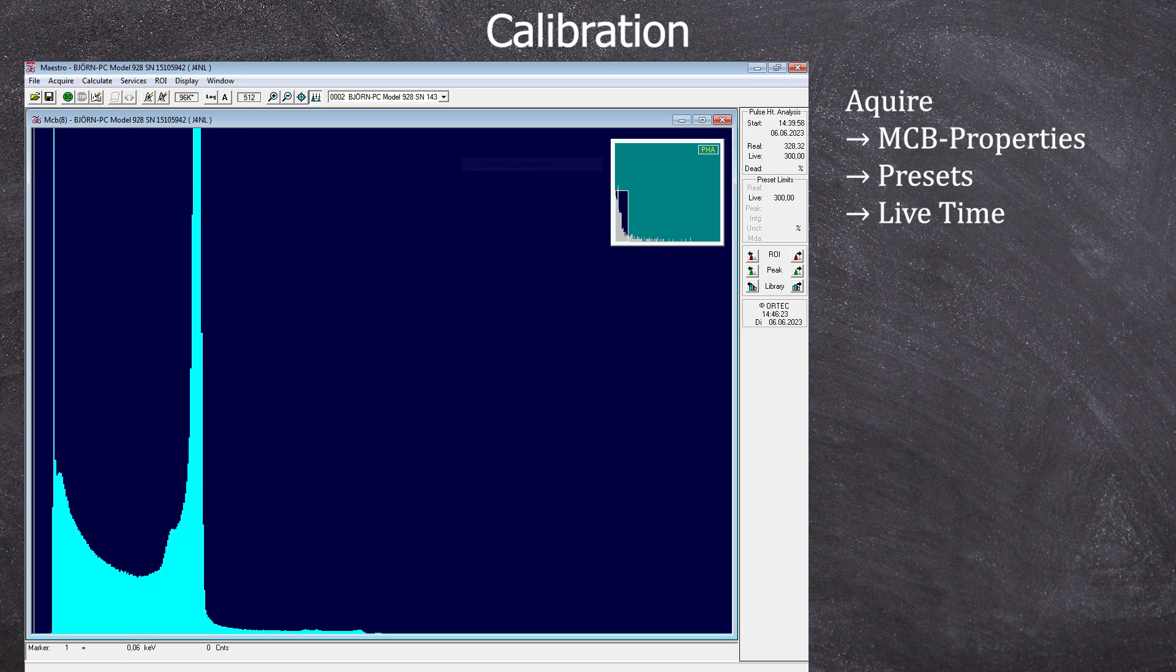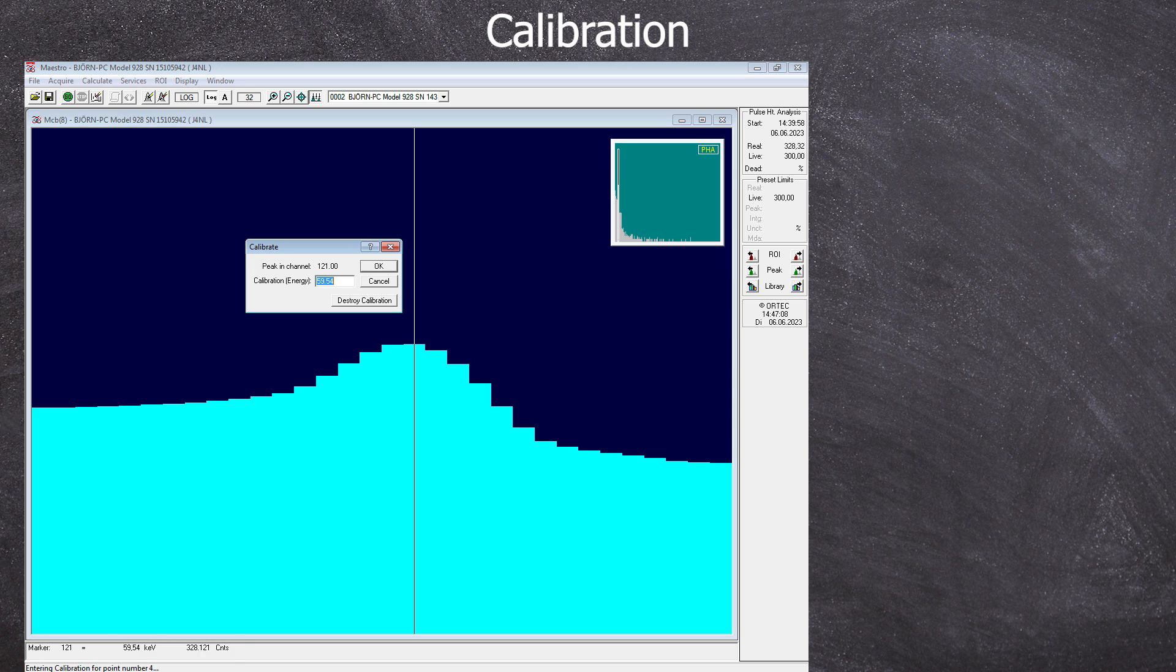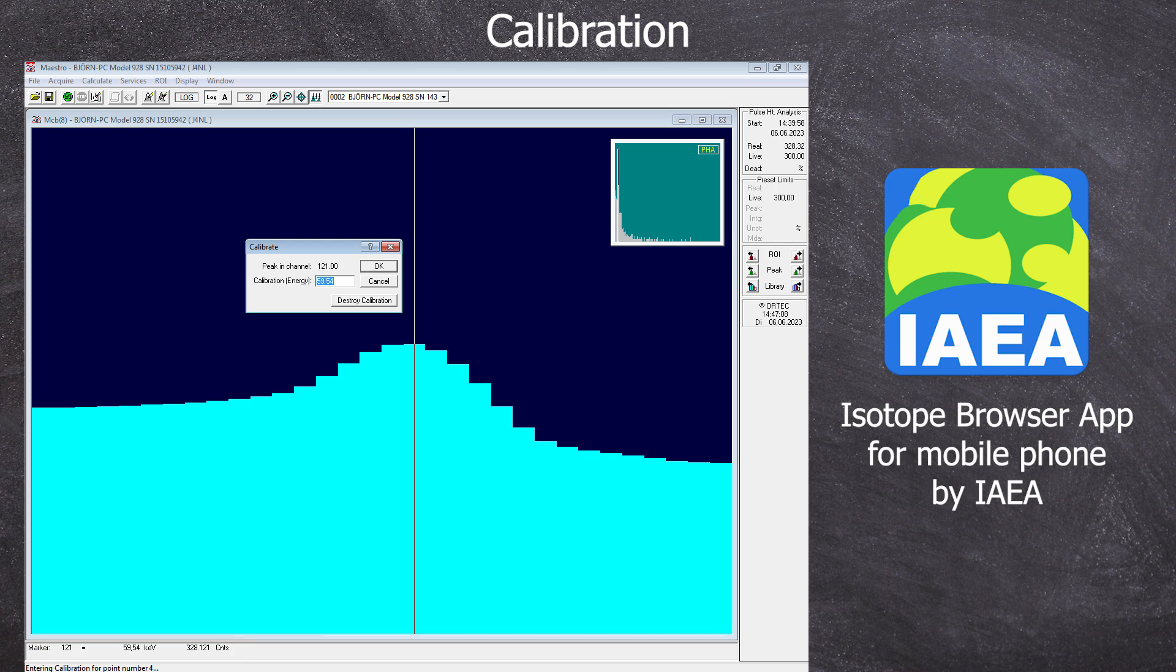We can clearly see a peak and now we need to assign a gamma energy to it. To do this, zoom in with the arrow keys until you have the exact channel with the most counts. In this case, it's channel 121. Use Calculate and Calibrate to assign the gamma energy listed in the Isotope browser app for Americium-241, which is 59.54 keV.